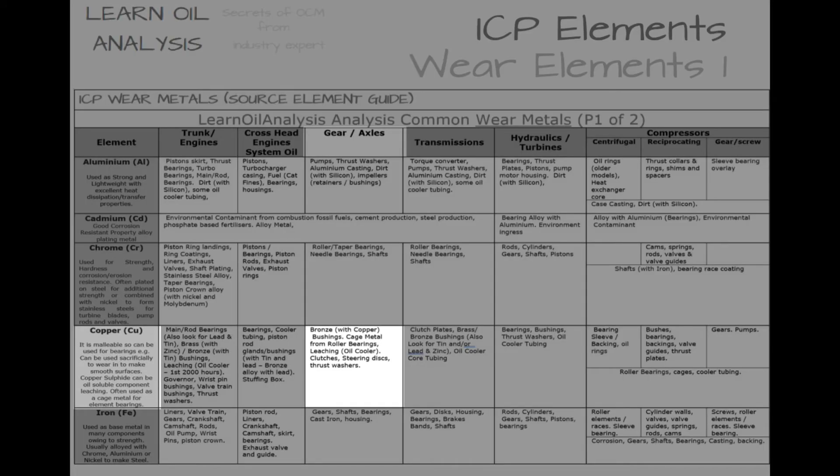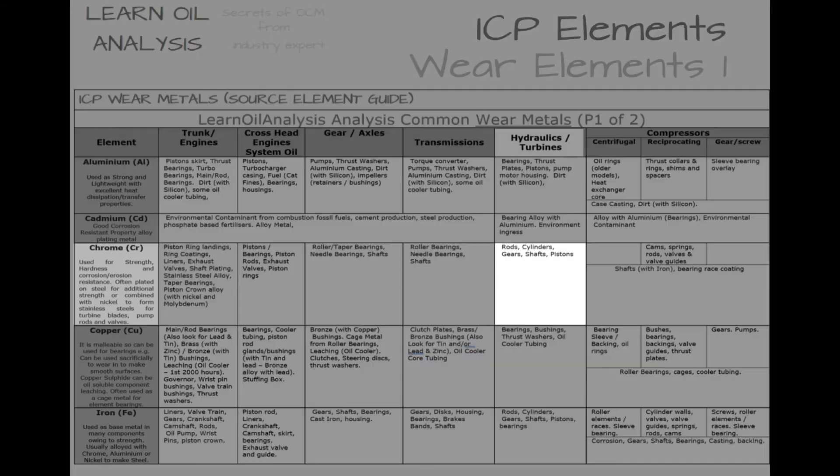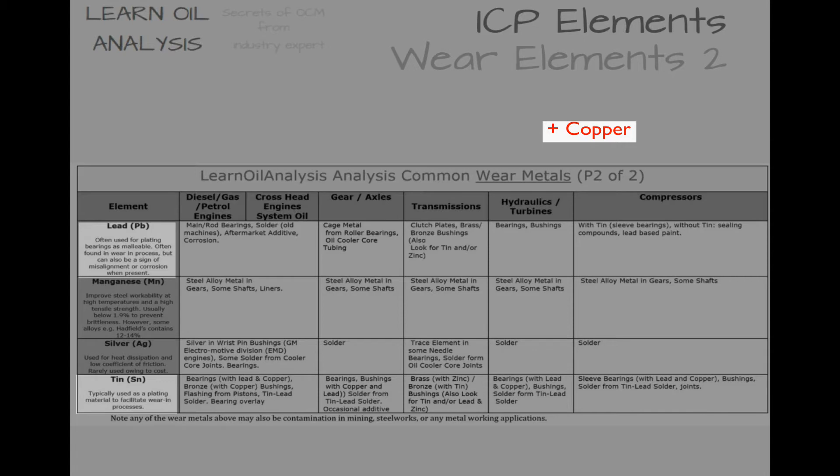Copper, on element bearings with a metal cage, tends to be cage wear if the only high element present, which could be a misaligned bearing. Chrome on hydraulics, on an excavator or digger, suggests wear to those nice shiny chrome-plated rods, which could be caused by a seal failure. Lead and tin, when also found with copper in an engine, suggest bearing wear.